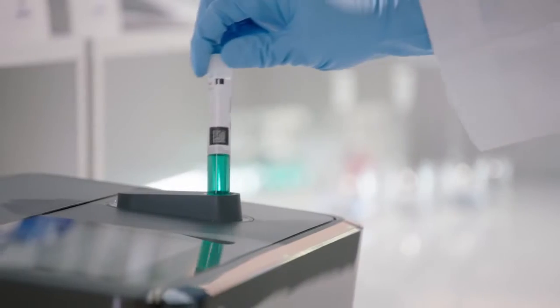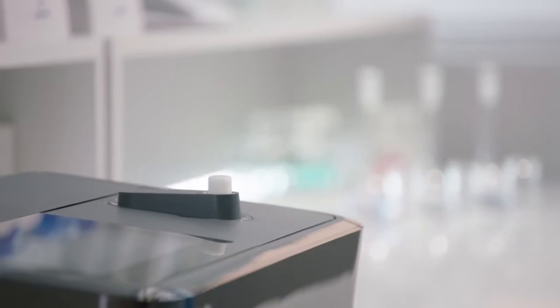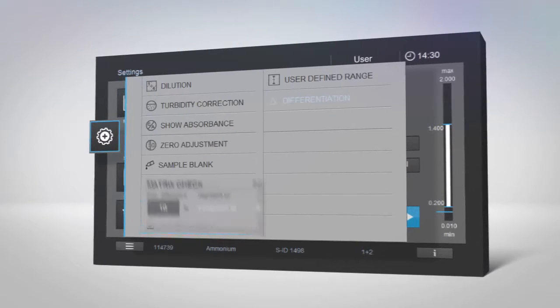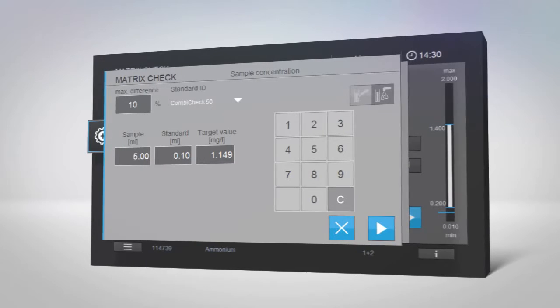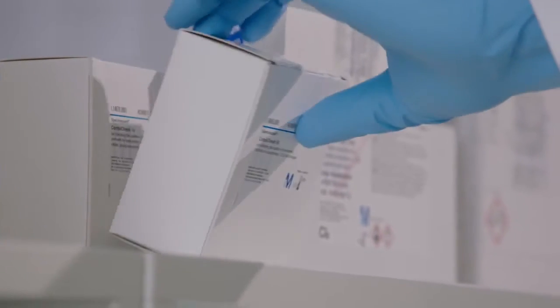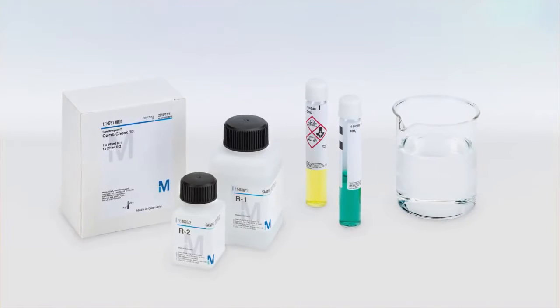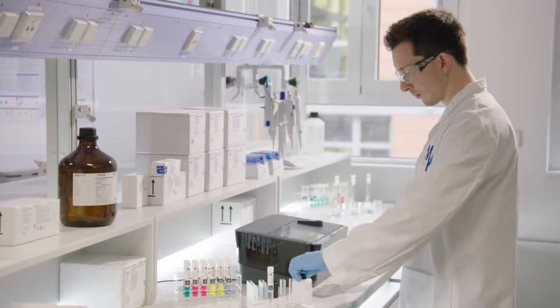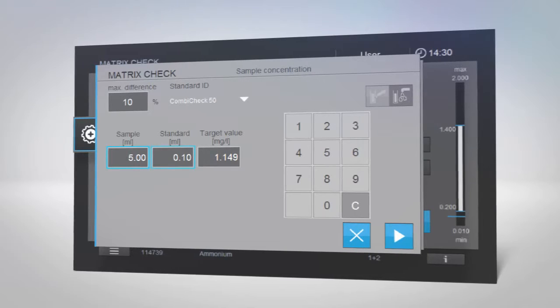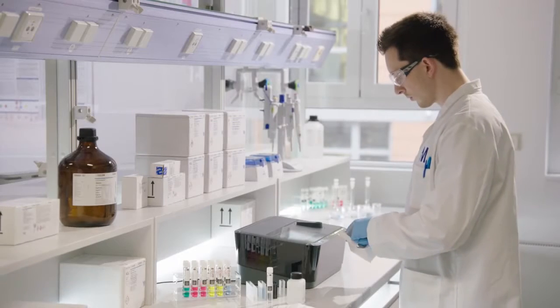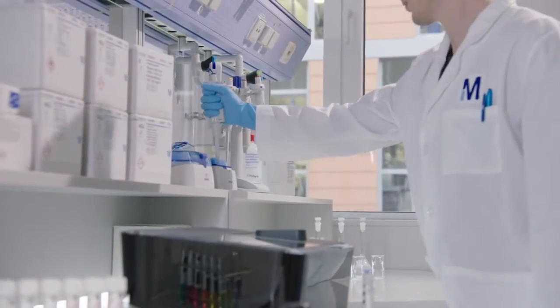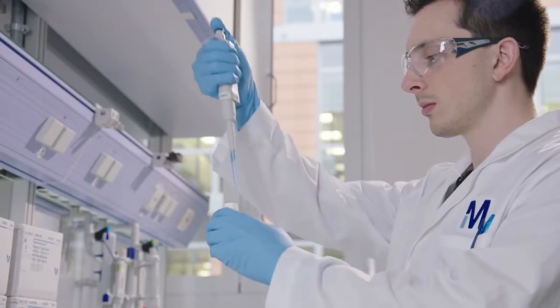The Matrix Check function helps you test whether other substances in your sample are interfering with your photometric determination. After your measurement, simply tap the Settings icon and select Matrix Check. SpectraQuant Prove will guide you through the whole process. A Matrix Check can be performed through addition or dilution. The process can be streamlined by using the SpectraQuant CombiCheck R2 addition solution or Merck Millipore's ready-to-use CRM standards, which are pre-programmed on SpectraQuant Prove. The required volumes of sample and standard will be shown on the screen. Prepare your measurement as usual, but add the required amount of R2 solution immediately after adding the required amount of your sample. Insert the cuvette and the system will run a Matrix Check.